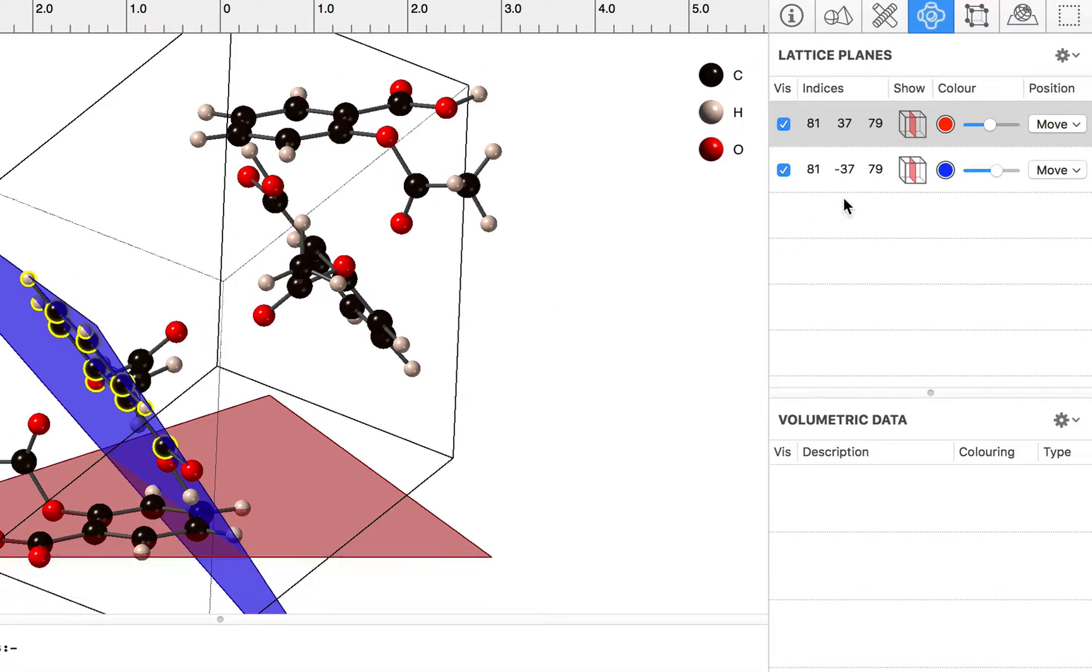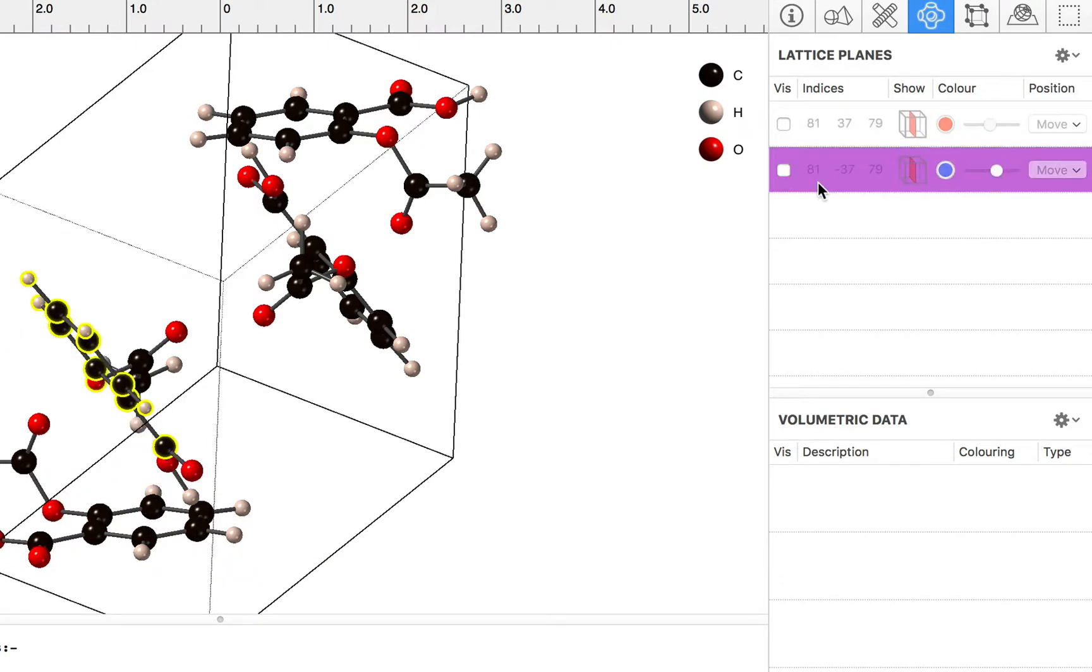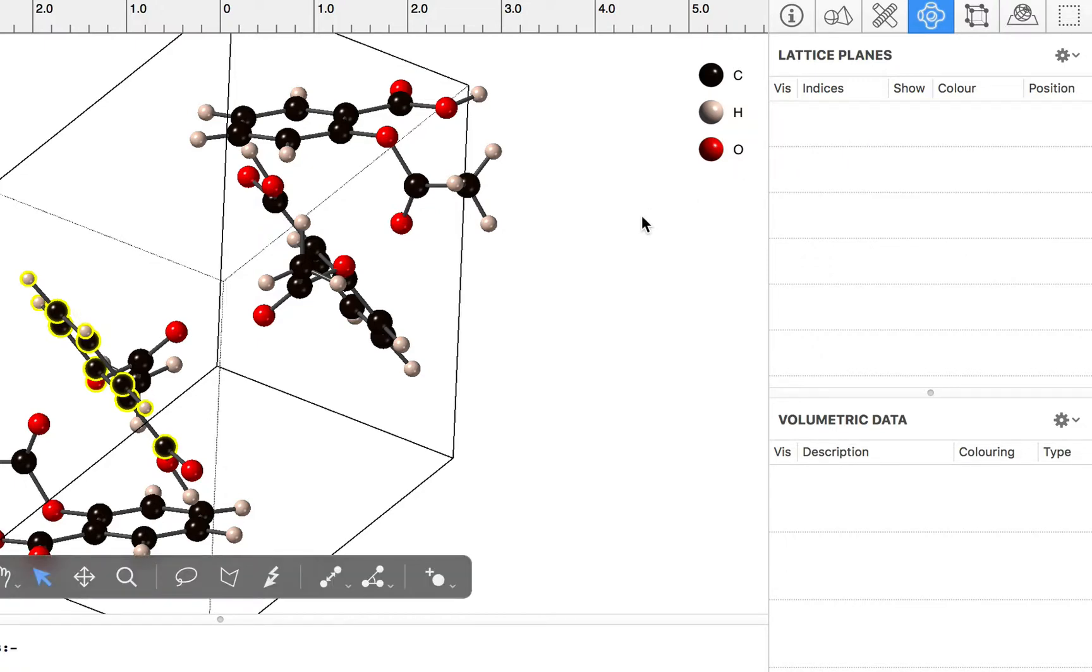Now once we've finished with those planes, we can turn them off by unclicking their checkboxes, and if we want to get rid of them completely we can select their list rows and press the delete key to delete them.